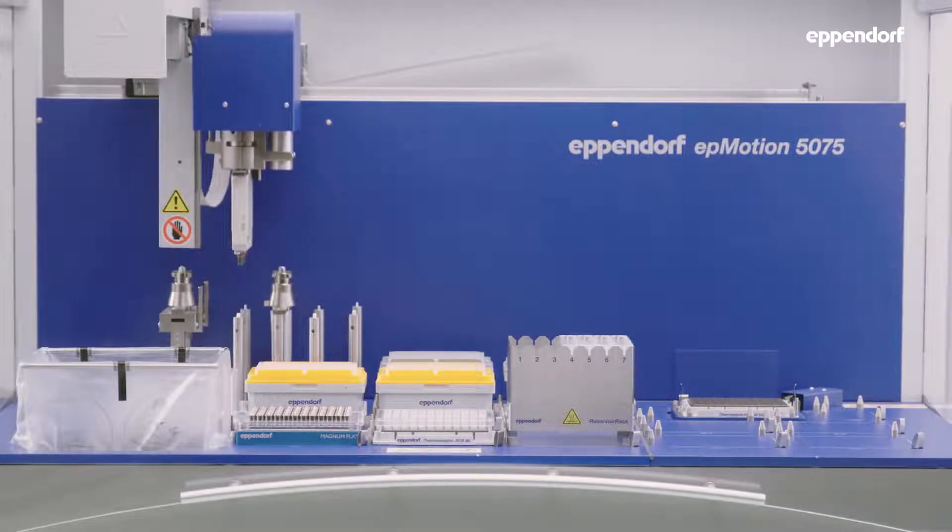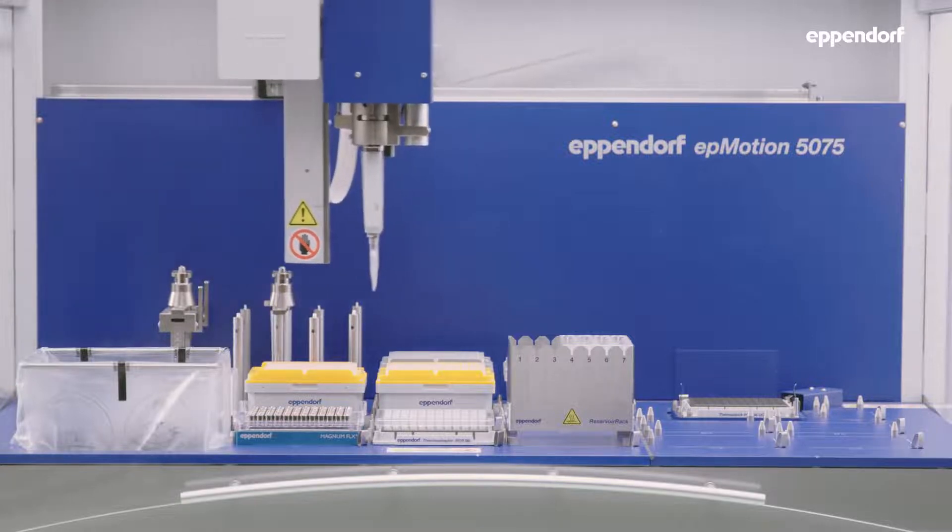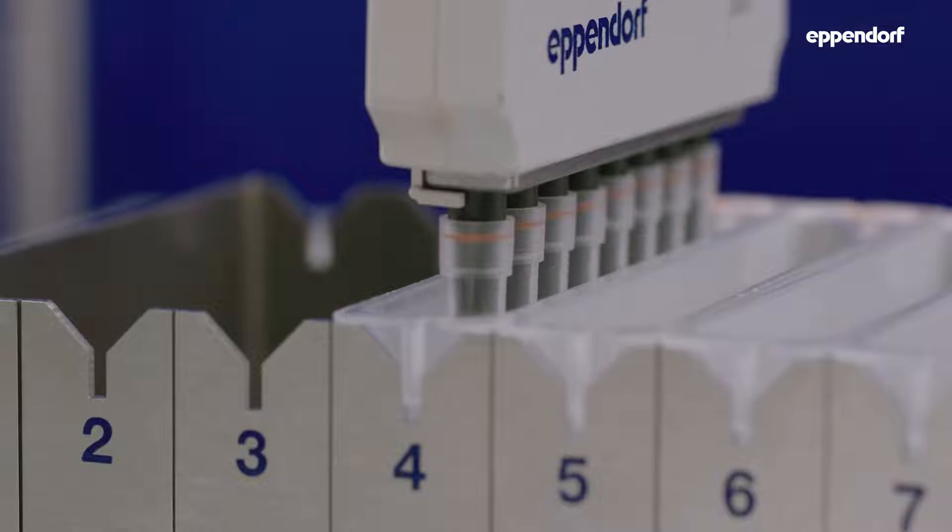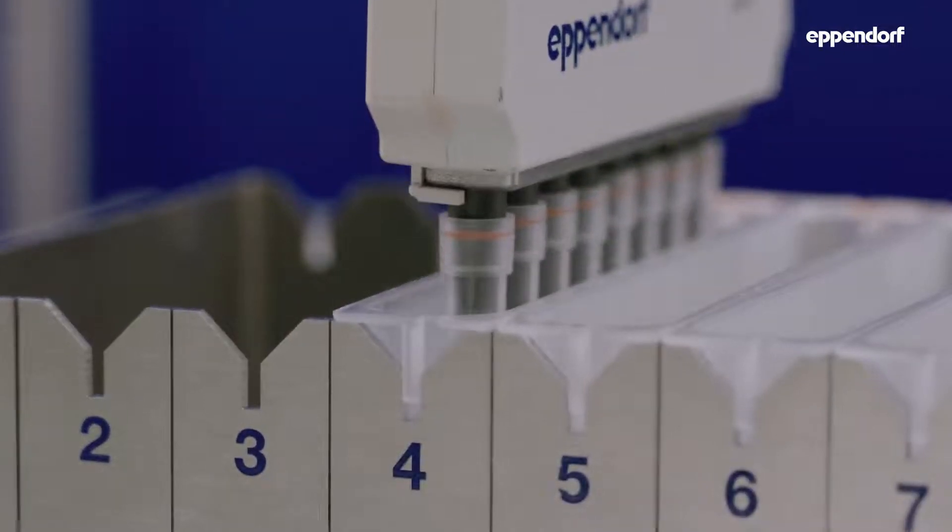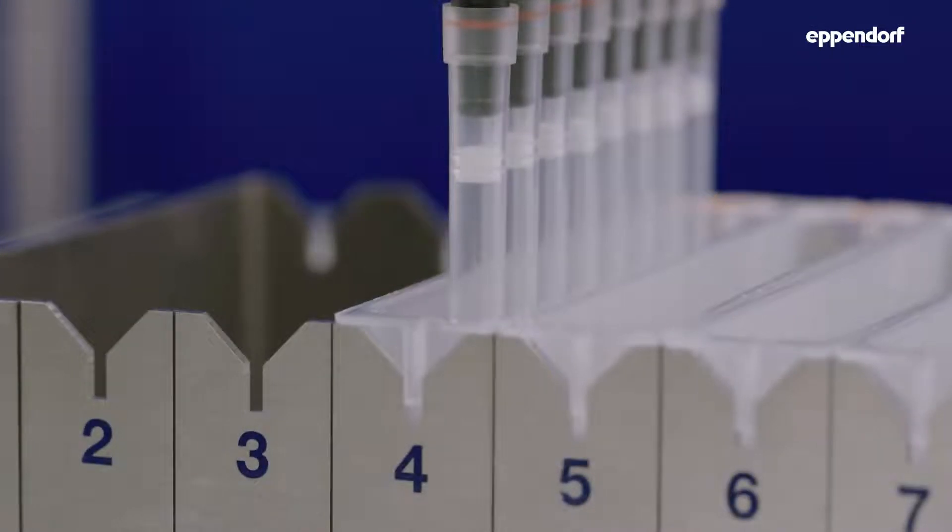In the first step of the bead cleanup, beads are added to the samples. By first tip mixing the bead solution in the reservoir, the beads get homogeneously distributed in the liquid so that equal amounts of beads can be transferred to each sample.